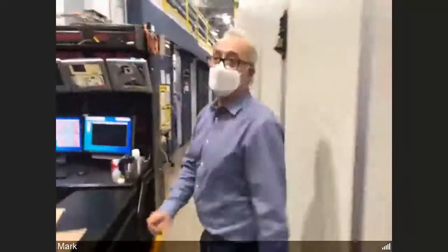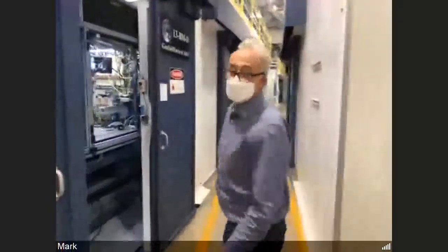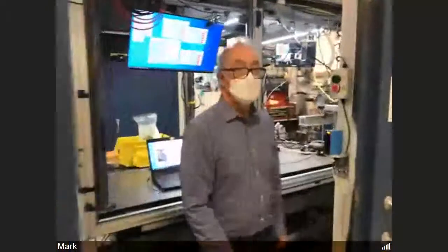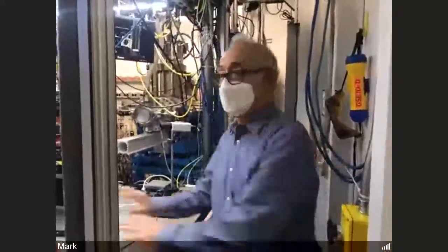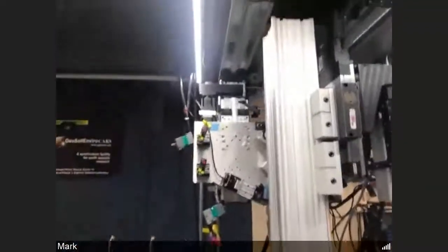So now I'm going to walk up into the experimental station. This is the 13 BMD station, and it's got three experiments running here. Right now we're doing the computed microtomography. At around this same location on this optical table, there are diamond anvil cell experiments with Brillouin spectroscopy. The Brillouin system is up above on an upper level of this optical table. It has a laser and a Fabry-Perot interferometer. Then these optics back here are what bring the laser beam down to the sample. But today we're doing tomography.